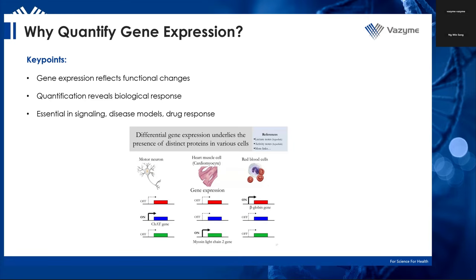These are all responses to external stimulus. What we can do with qPCR here is measure these differences, how much protein is produced. Even if we have the same gene for a particular type of protein, the amount that it is expressed is different from individual to individual.